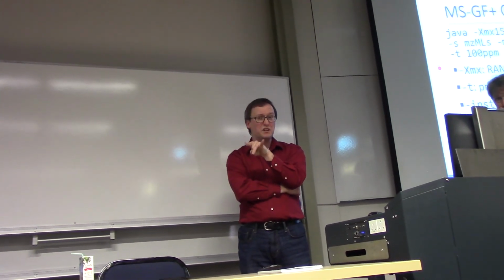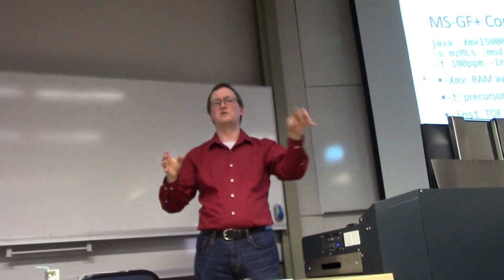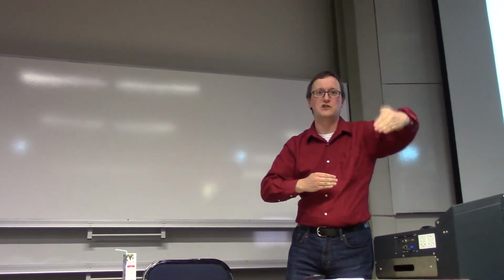I believe that Nelson was showing 400 to 1100? 1200, I think. 400 to 1200, okay. So that's a range of 800 m/z. You divide that by 25 m/z to get the number of swaths that you'd have to cut across that. So let's say that you change from 25 m/z swaths to 12.5 m/z swaths. Now each swath has less crosstalk, so the fragments have come from half as many peptides. So our identifiability goes up, but the time with which we sample each chromatogram halves. So that's not good.